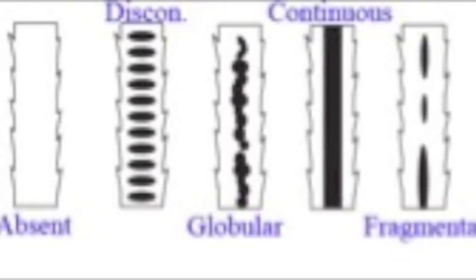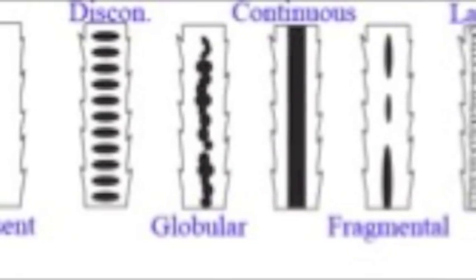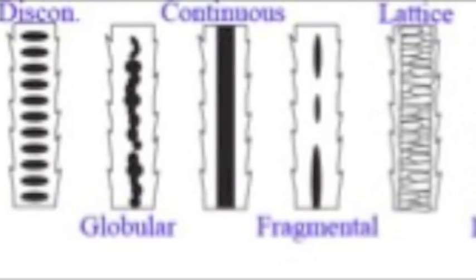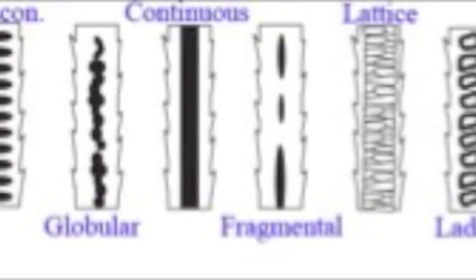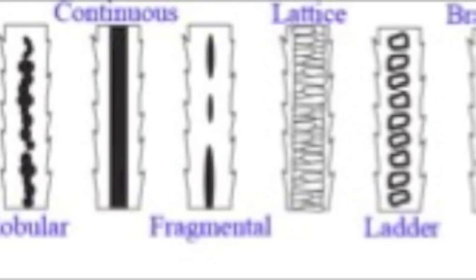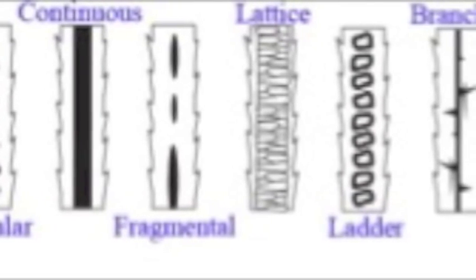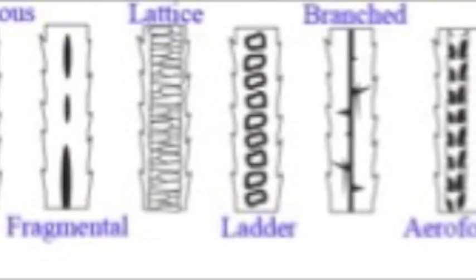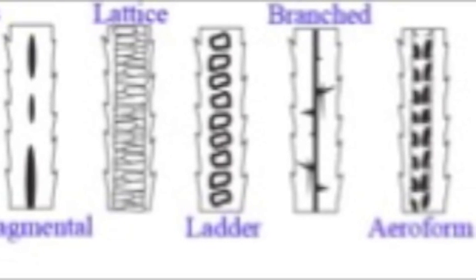The medulla can appear in many forms depending on the species of hair. Several patterns can be observed, including ladder, lattice, vacuolated, and amorphous forms. It can be continuous, discontinuous, or even absent. The width of the medulla also varies. The medullary index, or the ratio between medulla diameter and the total diameter, can be an important characteristic for determining species. Human hairs generally share the same microscopic characteristics that make them distinguishable from animal hairs.